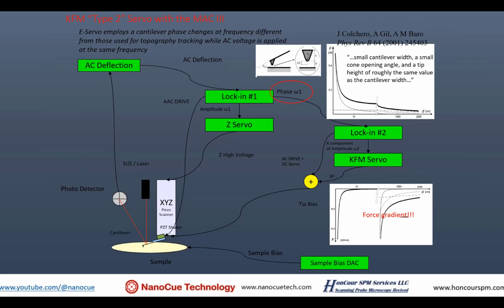So in our scheme, we pulled the phase signal from our first lock-in and used that as the input signal to our lock-ins in the scheme.